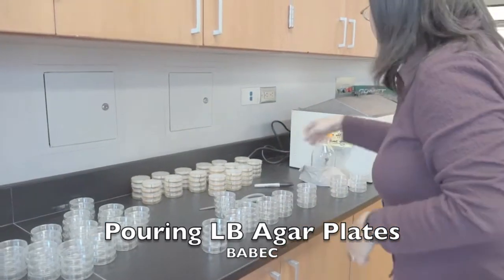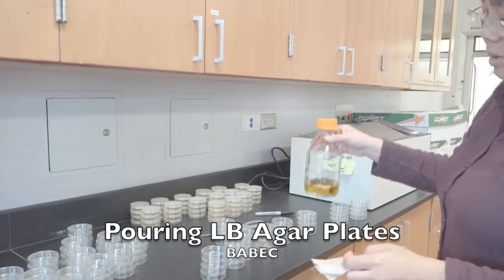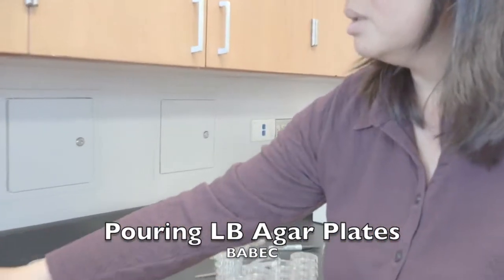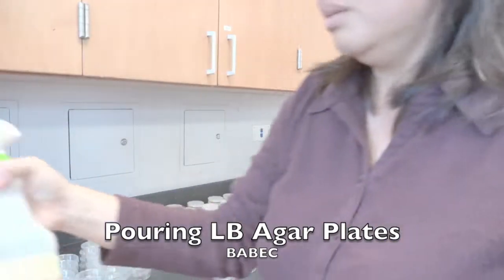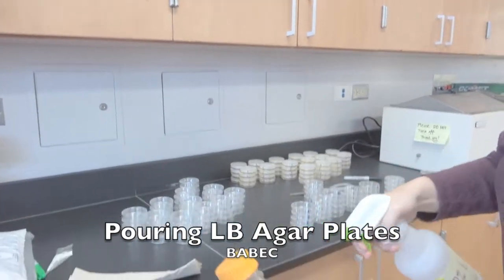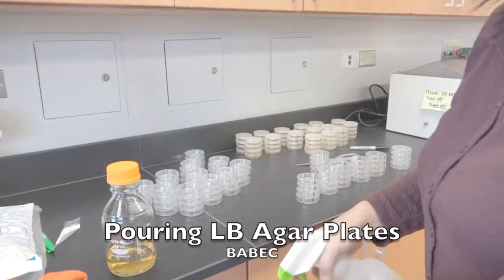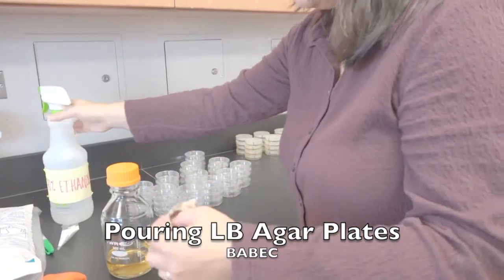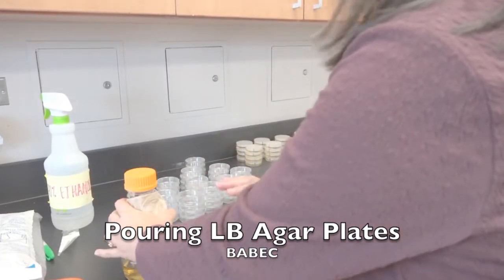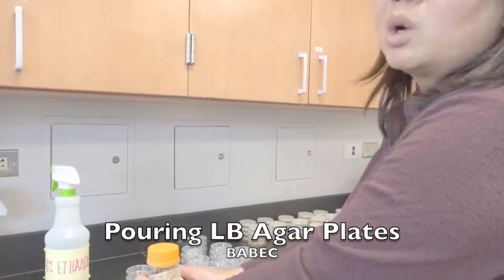Once that's ready, I have about 100 mils of LB agar here. I like to spray my bottle with ethanol first just to make sure that the whole thing is relatively clean. This is a clean paper towel that I also spray, and I do this so that it prevents drips on the side. Notice we're not flaming, we're not putting it in a hood — the whole idea is that you pour quickly.